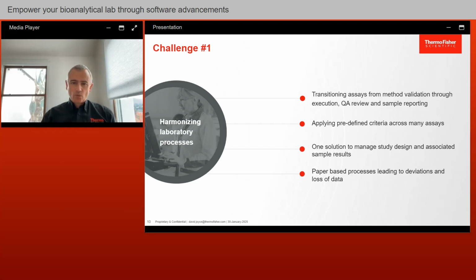Having one place to go to access that data, to bring all of that stuff together, rather than multiple spreadsheets or paper systems, really is key, especially when you've got a long-running study that has maybe got thousands of analytical runs, hundreds of subjects who are constantly on the go, moving, coming in and out of that. Many sites you'll be transferring data from and to. That gets tough. So having something that is dedicated to doing that work and ensuring that your paper trail is managed is essential.